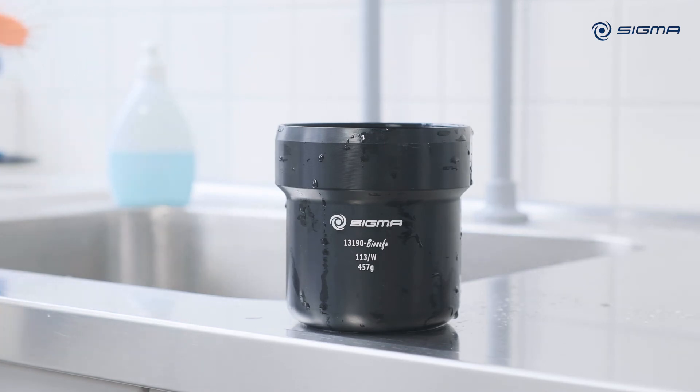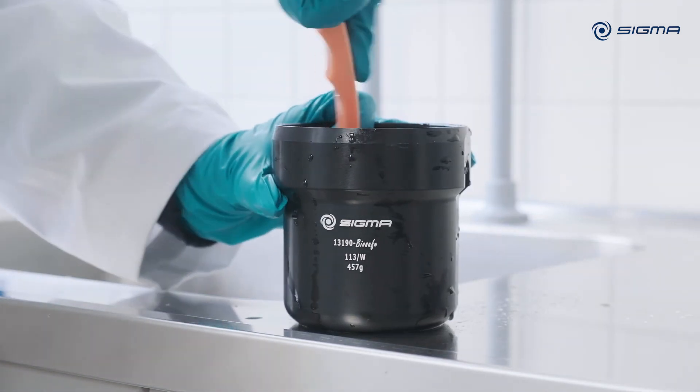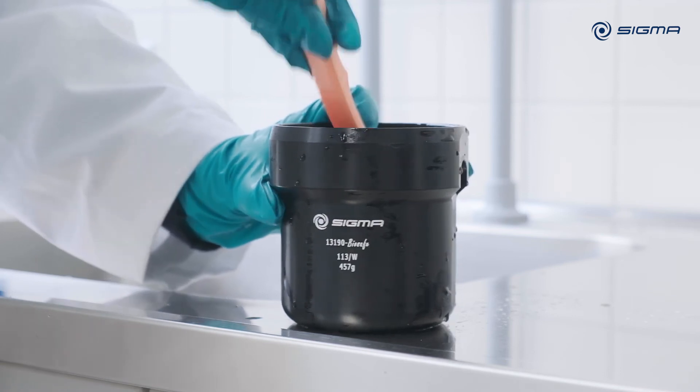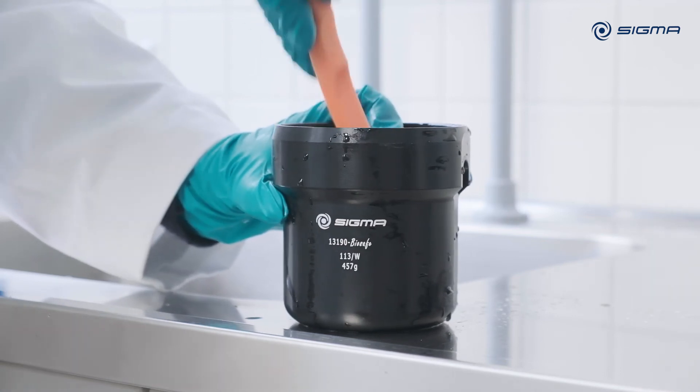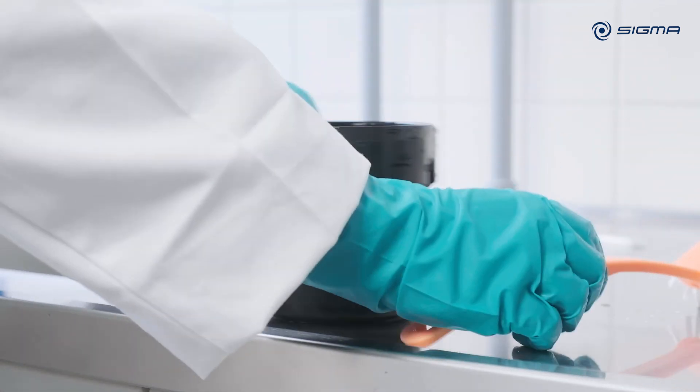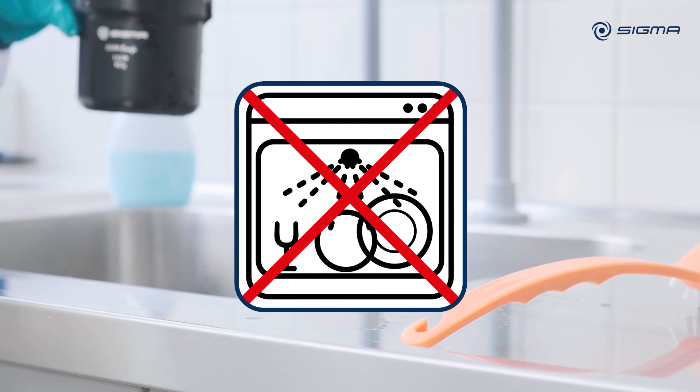If the centrifuge is used daily, clean the accessories outside the centrifuge at least once per week. Use a neutral pH cleaning agent to clean the centrifuge and the accessories. Never clean aluminium rotors or aluminium accessories in a dishwasher.